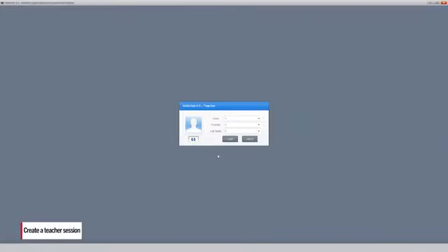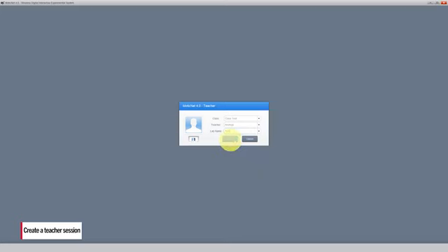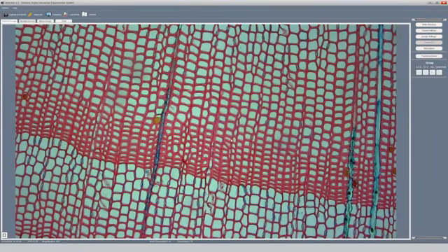As a teacher, you can create a new class or choose one previously saved. To create a new one, first enter the class name. Then, enter the teacher's name below or choose one from the drop-down menu. Finally, in the lab name field, you can assign a title to your lab or practice. For example, you can use a date or a topic. In our case, we type test as an example. Please remember to choose a clear and representative name because this name will affect future practice names. Once this is done, click on Login to enter the MoticNet software.